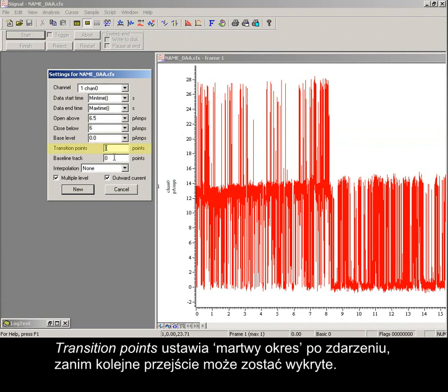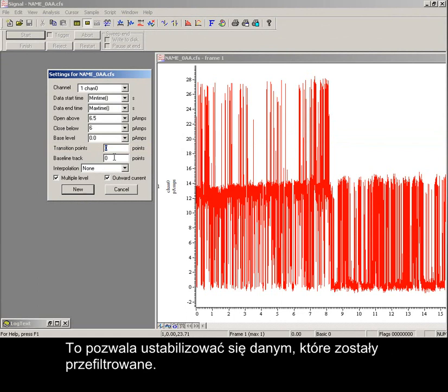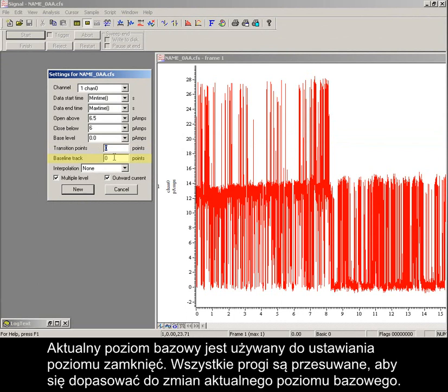Transition points provides a dead time after an event, before another transition can be detected. This allows for settling of data which has been filtered. Baseline track sets the number of points to average to produce a current baseline level. The current baseline is used to set the level for closed events, and all thresholds are shifted to match changes in the current baseline level.